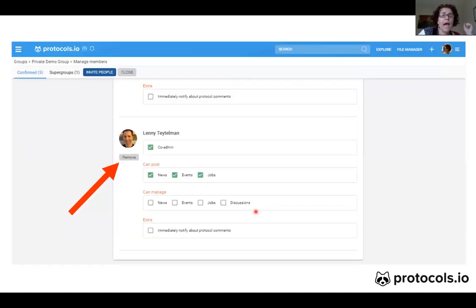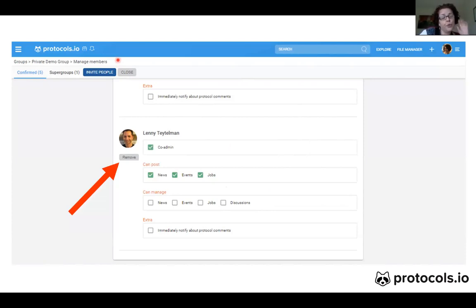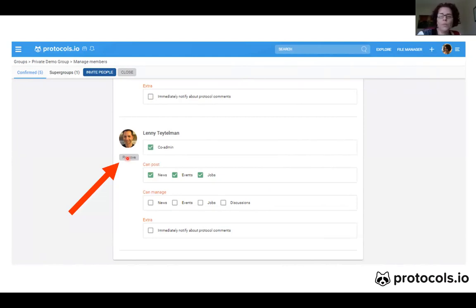After that, I can come back to the Manage Members page of the group and click Remove. Once that person is removed from the group, they won't be able to access the group files anymore and they won't even be able to see the group on Protocols.io anymore.